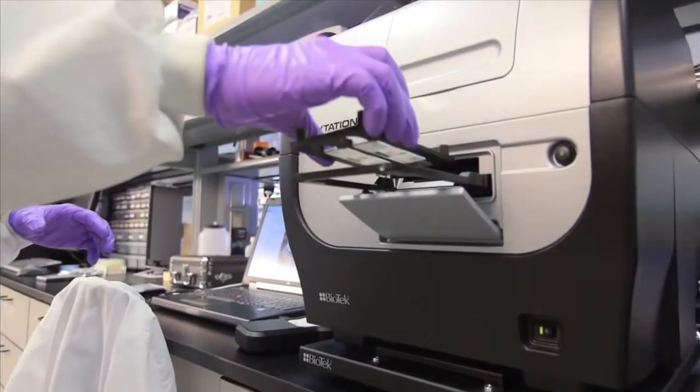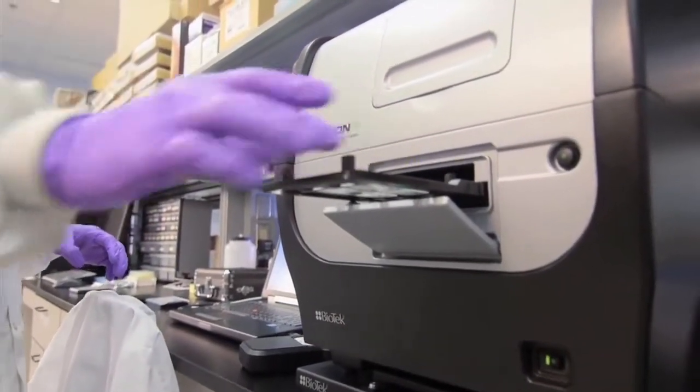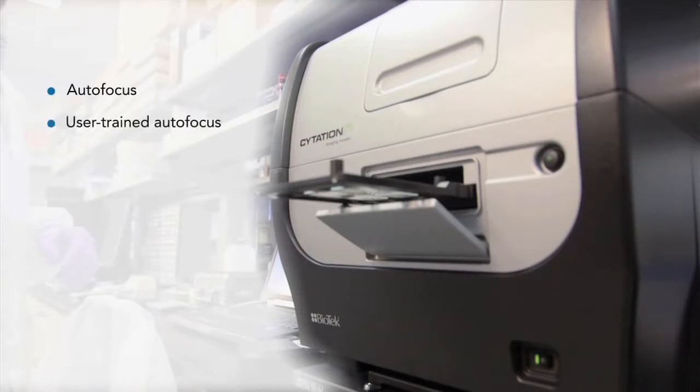Easy operation is critical to streamlining workflows, and Gen5 software features autofocus, user-trained autofocus, auto-LED, and auto-exposure for ultimate ease in image capture.